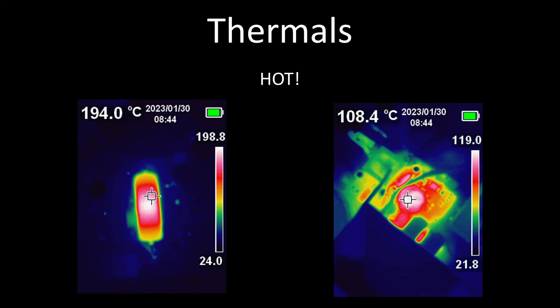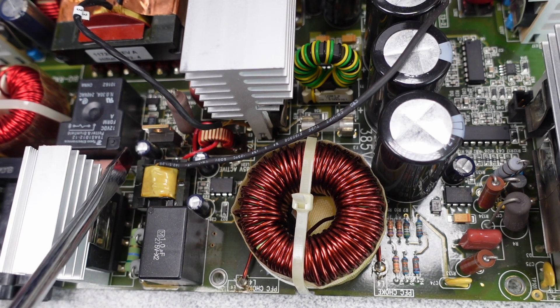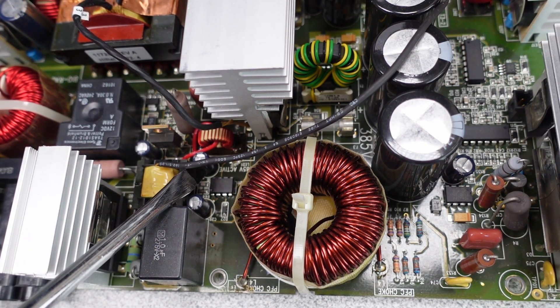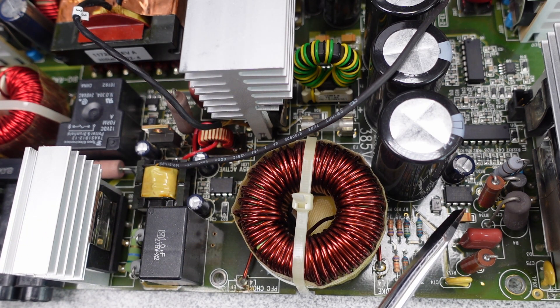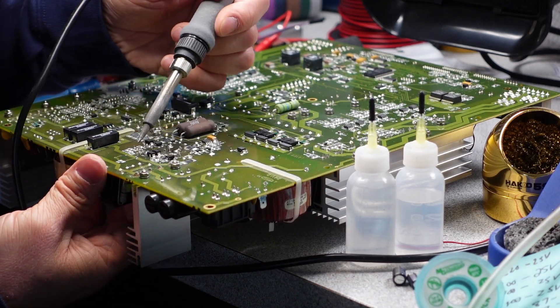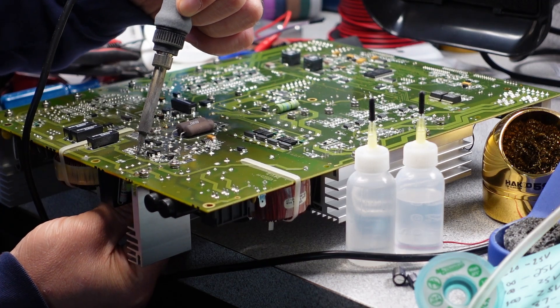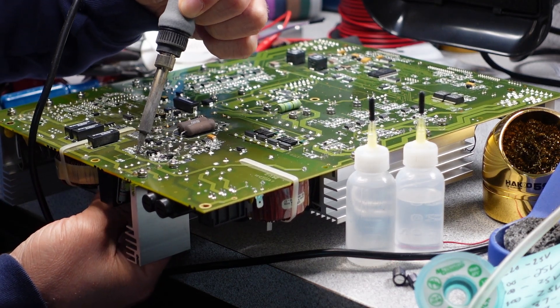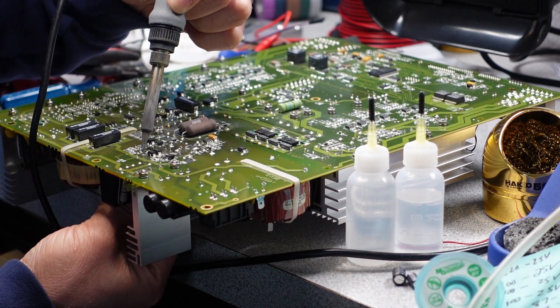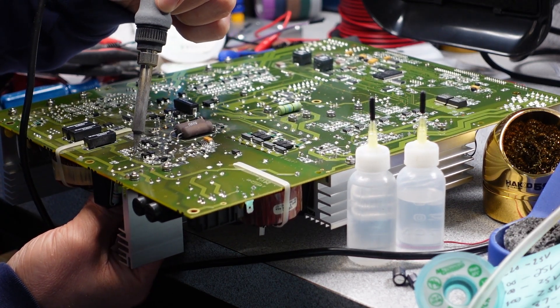Identifying the problem — it's capacitors. It's always capacitors. The small DC power supply that brings the standby power to the power factor correction circuit board is losing power as it tries to start up, and therefore it hiccups as it builds enough energy to try and start again and again. It looks like there is no fault protection of this failed power supply section, so the rest of the machine continues as if normal, drawing huge power in short bursts. So it doesn't have enough storage — capacitors store to keep the power factor correction circuit powered. There are four small capacitors, all relatively low voltage, all around this standby power supply that should be replaced.